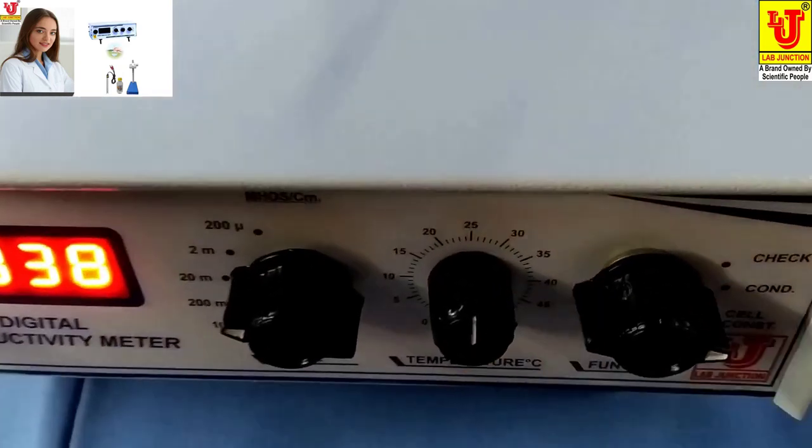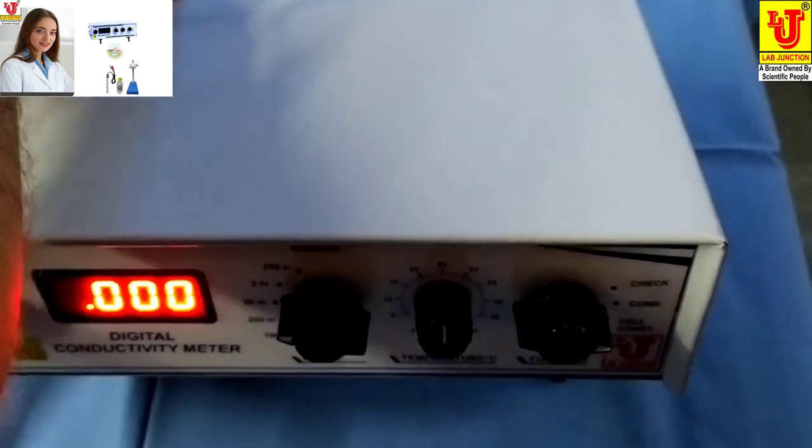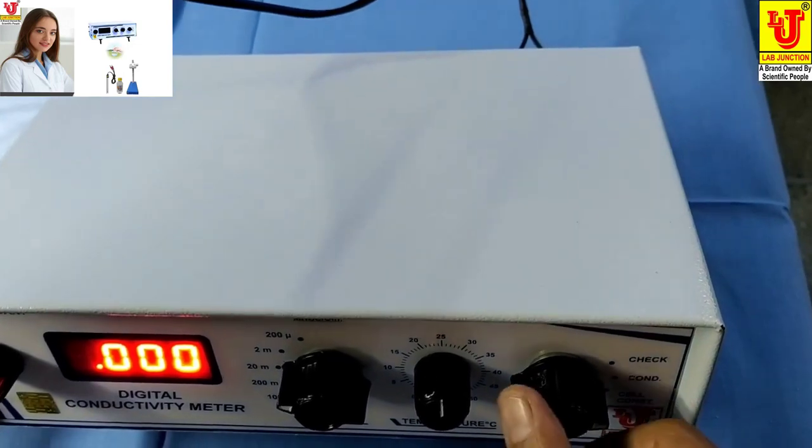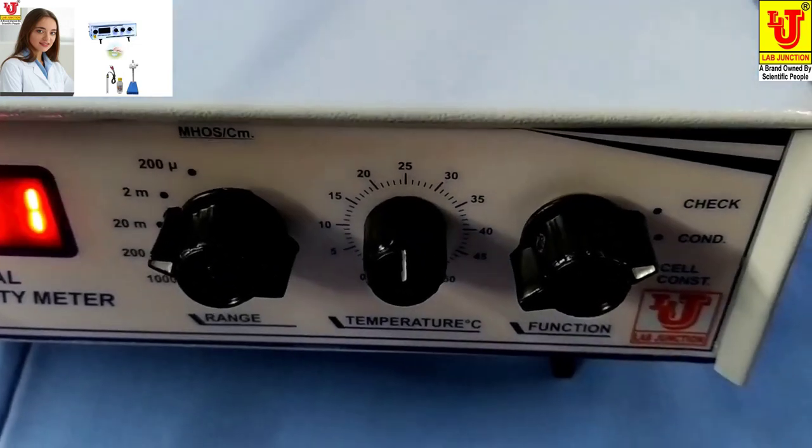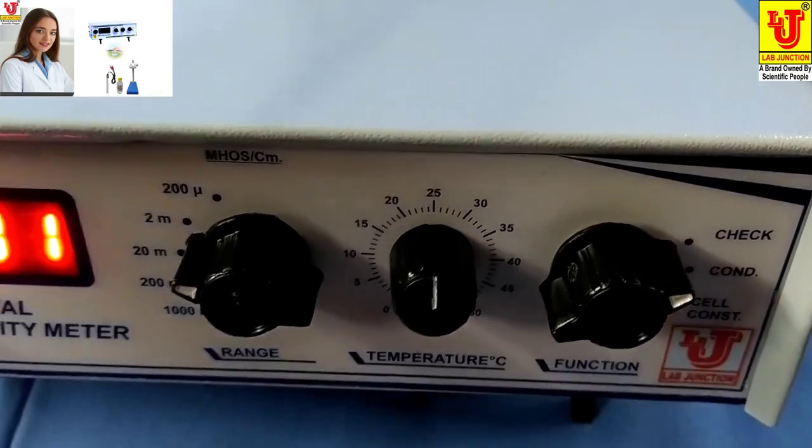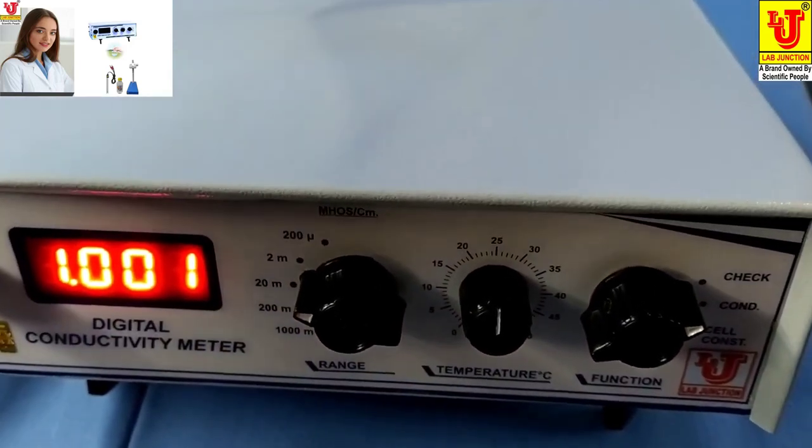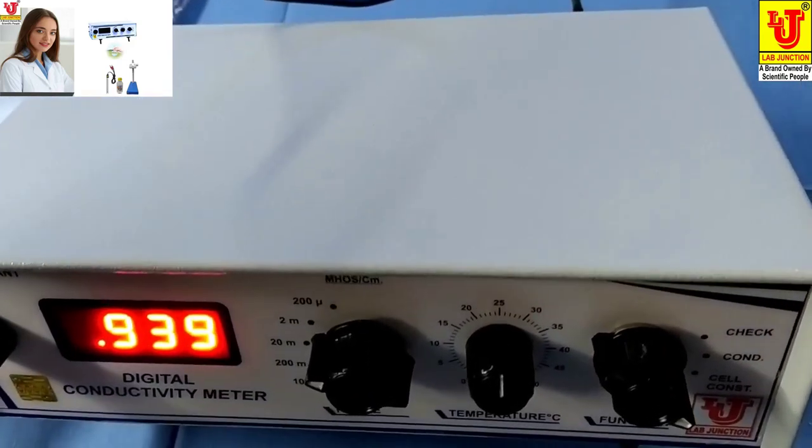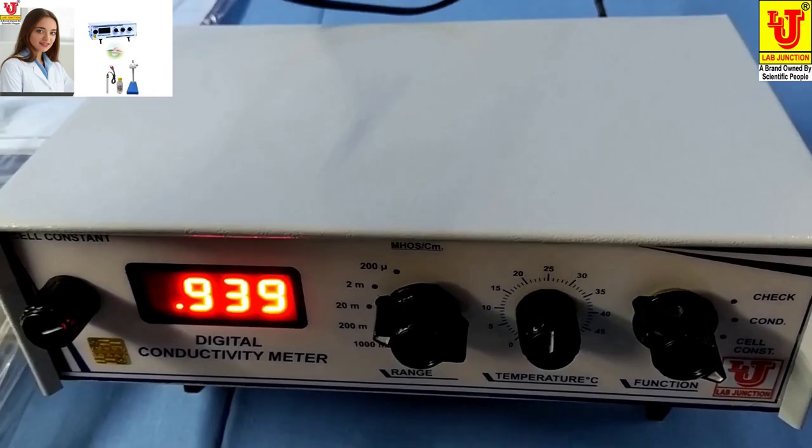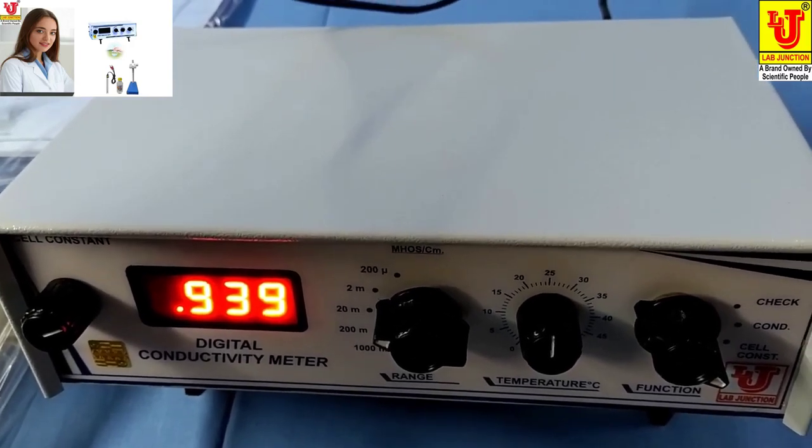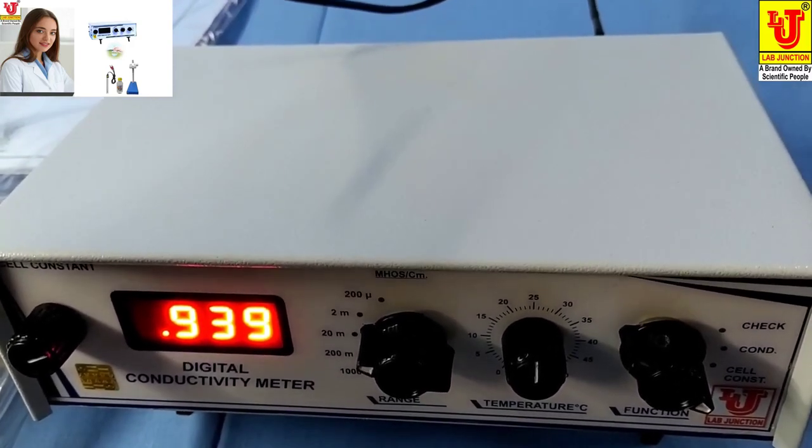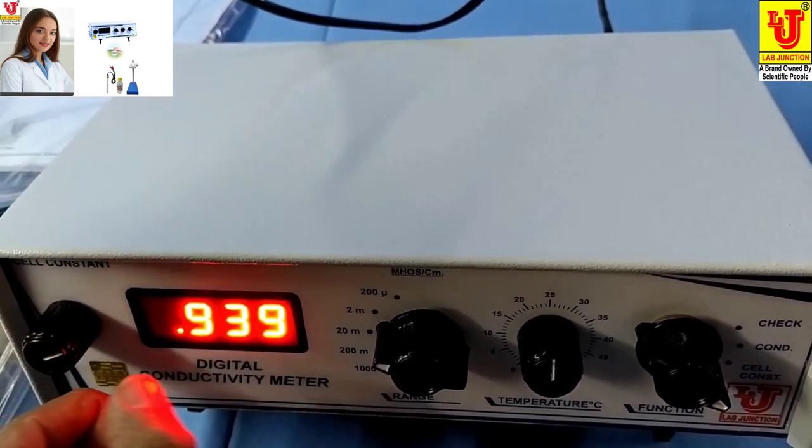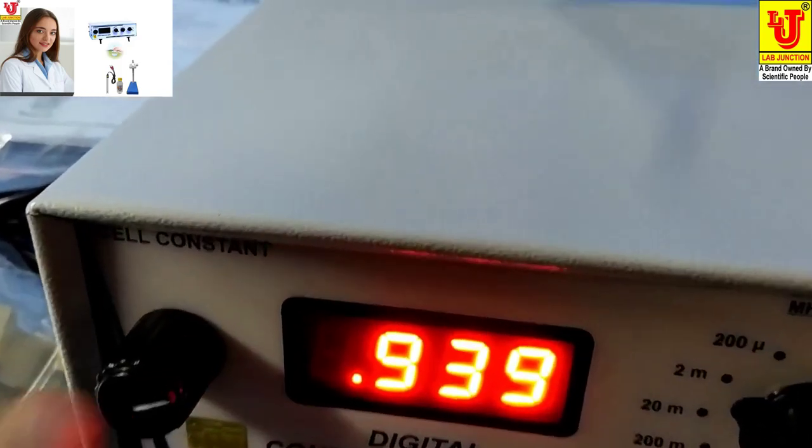You can again switch on the machine like this way. You check your position that is 1.000. Now you directly go to cell constant. You have noted 0.939 on your notebook. Then insert same value with the help of cell constant knob, 0.939 from cell constant knob.